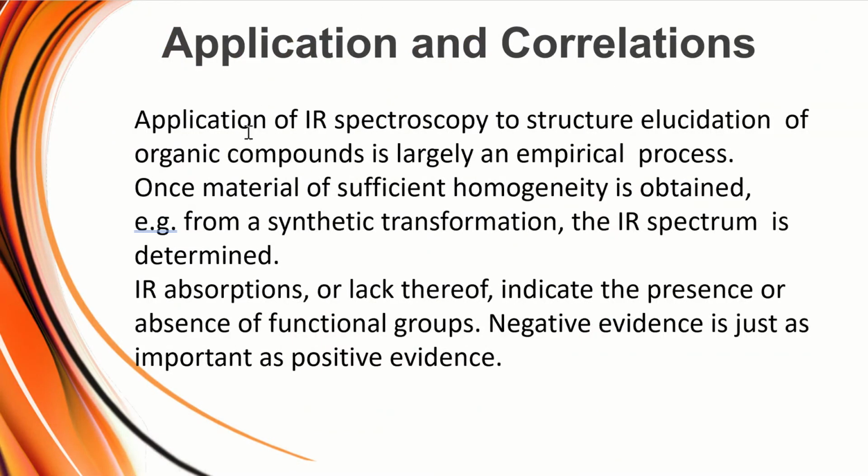Application and correlations. Application of IR spectroscopy to structure elucidation of organic compounds is largely an empirical process. What structure elucidation means, and that's kind of what we'll be doing for this semester, is we apply IR spectroscopy to figure out the structure of compounds. So if we're starting off with an unknown compound, we're trying to figure out what the structure is. We call that structure elucidation, and IR is very heavily used in that area.